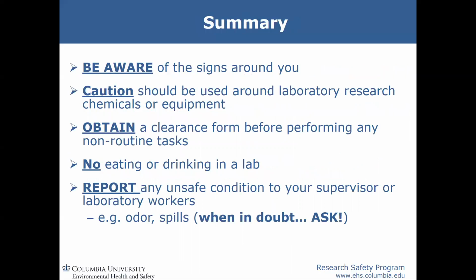Okay, so summary. Be aware of the signs around you. Caution should be used around laboratory research chemicals or equipment. Obtain a clearance form before performing any non-routine tasks. No eating or drinking in a lab. Report any unsafe condition to your supervisor or laboratory workers, and for example, this includes odors or spills. The odors are very common at the medical center. So when in doubt, just ask. It never hurts to call.